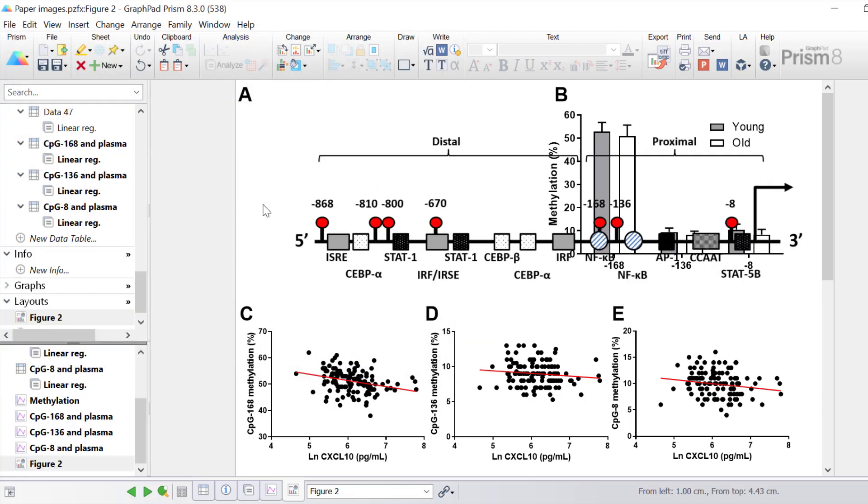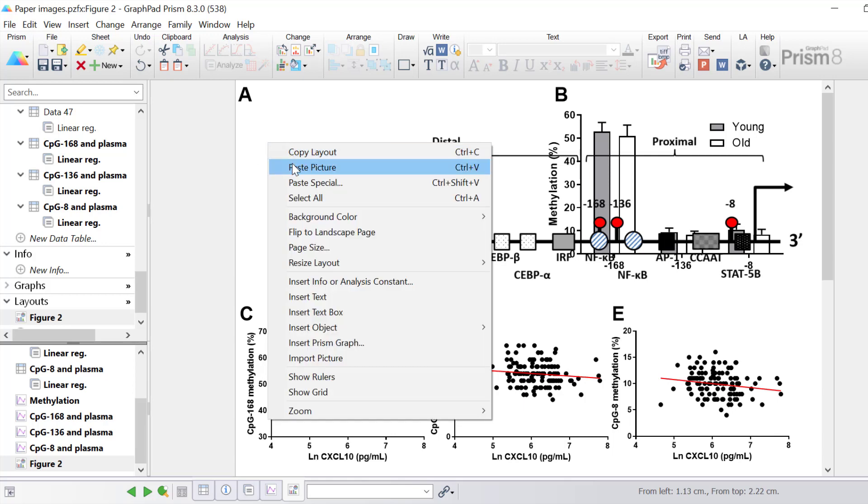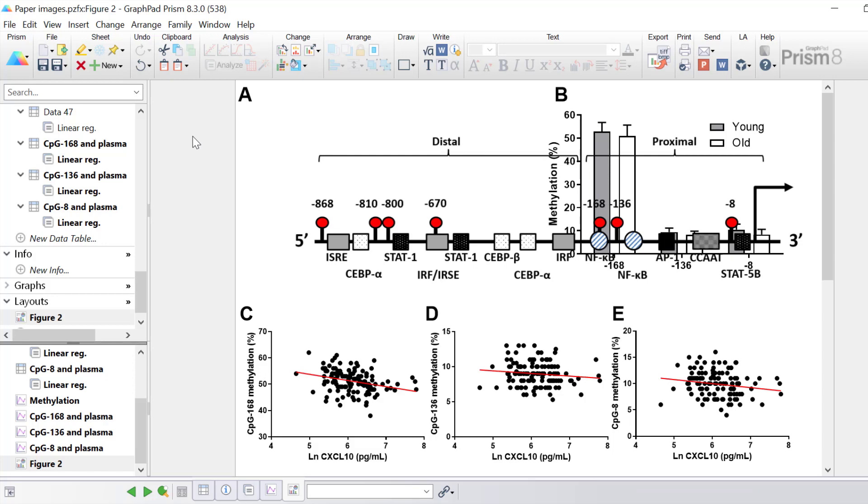It is also worth mentioning that there is another way that you can insert a picture into Prism and that is to use the copy and paste function. For example say you had an image open in another program such as Microsoft Word or PowerPoint. You can right click and copy that image within the program and then within Prism you simply right click and then select paste picture. This will paste the picture into Prism.